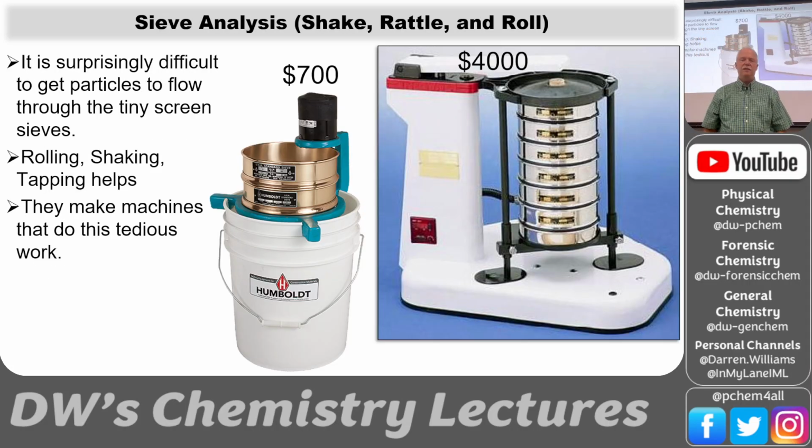Now, the bulk, like large particles. Let's say you have mud on a boot, and that's your questioned article. You can scrape off that mud, and then you could do a sieve analysis and see what the particle size distribution is of that mud, whether it's a clay or a silty soil. And then you could go to a scene.